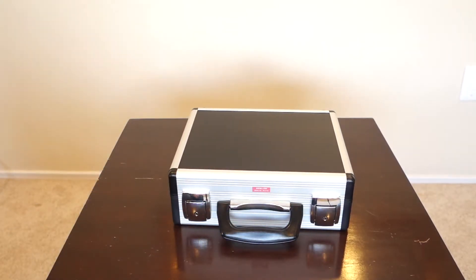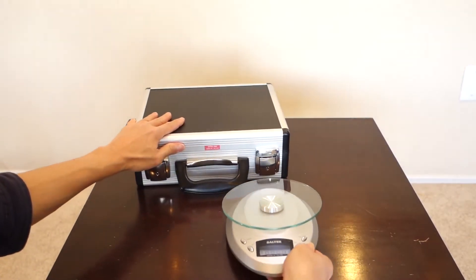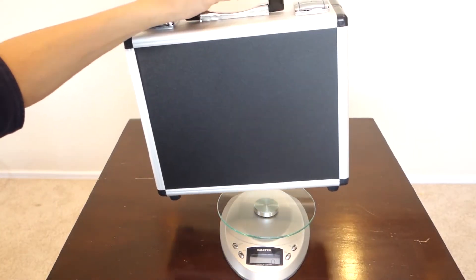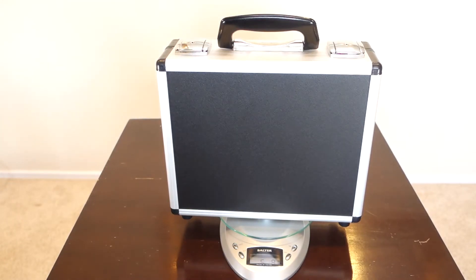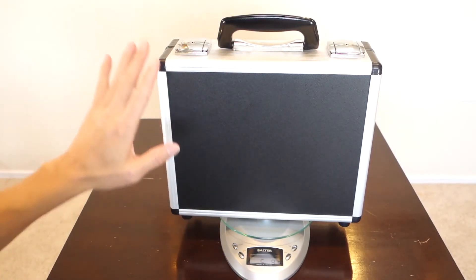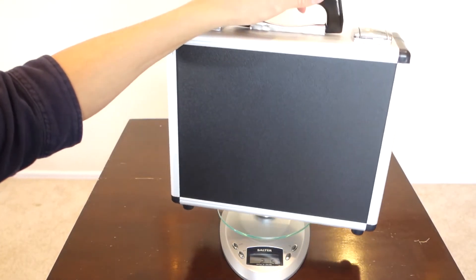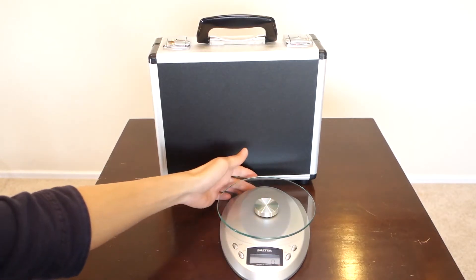One last thing — I want to measure how heavy the full case is. I'll bring back the scale and reset it to zero. The Torimeter with the case, everything in total, reads 5 pounds and 9 ounces — a little under 6 pounds. So with the case it's a bit heavier, but still under 6 pounds.